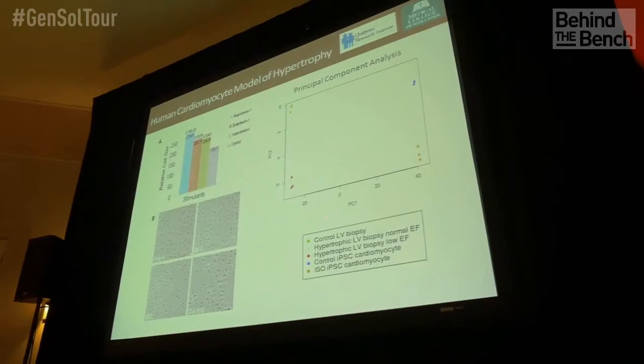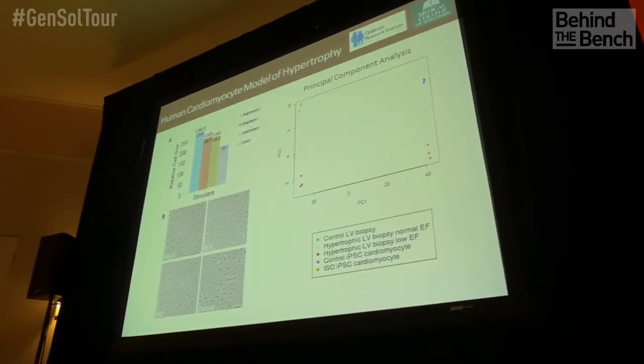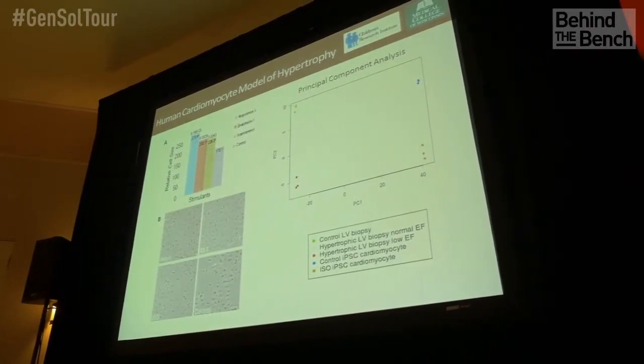We can now use it with really small amounts of cells, which is very important for working with human samples, because oftentimes you can't get a lot of cells. It's not like working with a cell line where you can grow up tens of millions of cells. Here, whatever sample you get, that's what you have to work with. So with Ion Proton technology, we can do ChIP sequencing and create some of these epigenetic signatures with these human samples. If I remember your data, you had 20 million cells all the way down to 1.